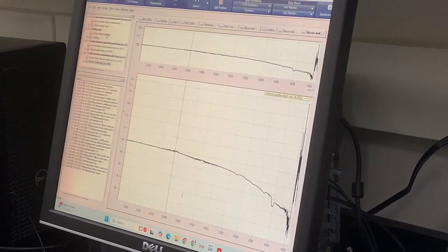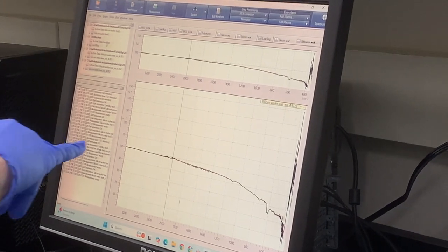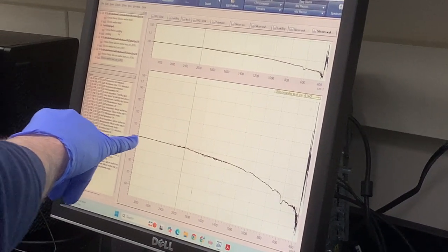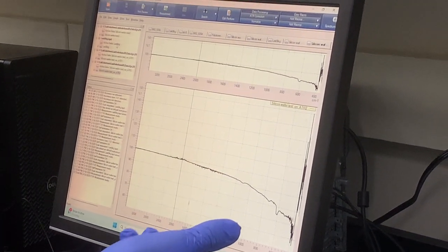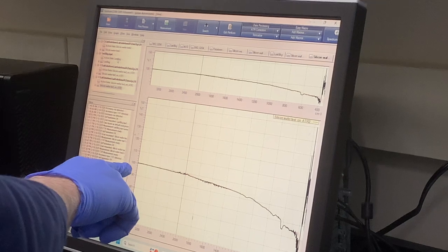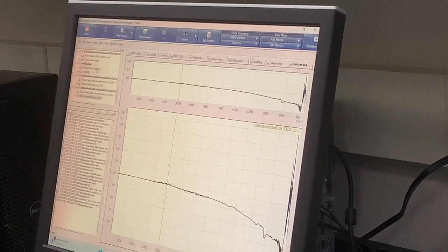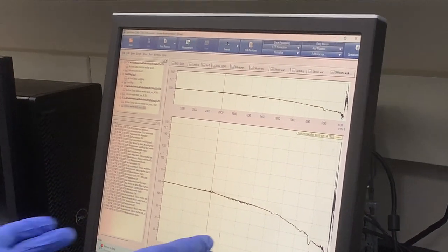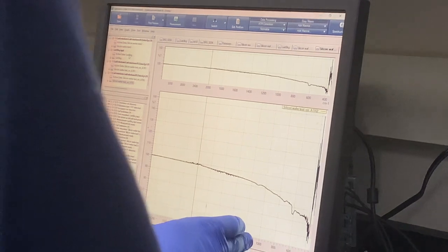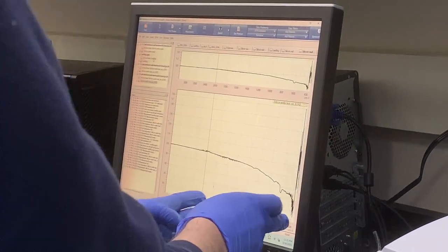Yeah, it's not giving me good signal. It never gets signal. So what does it mean? It says 100% transmitted here. Does that mean the sample is 100% transmitted, or is it not an indication because it says 100%? The amount transmitted, in fact, should be 100%, which means all this range is transmitting at this wavenumber and only transmitting around 90% of this range.